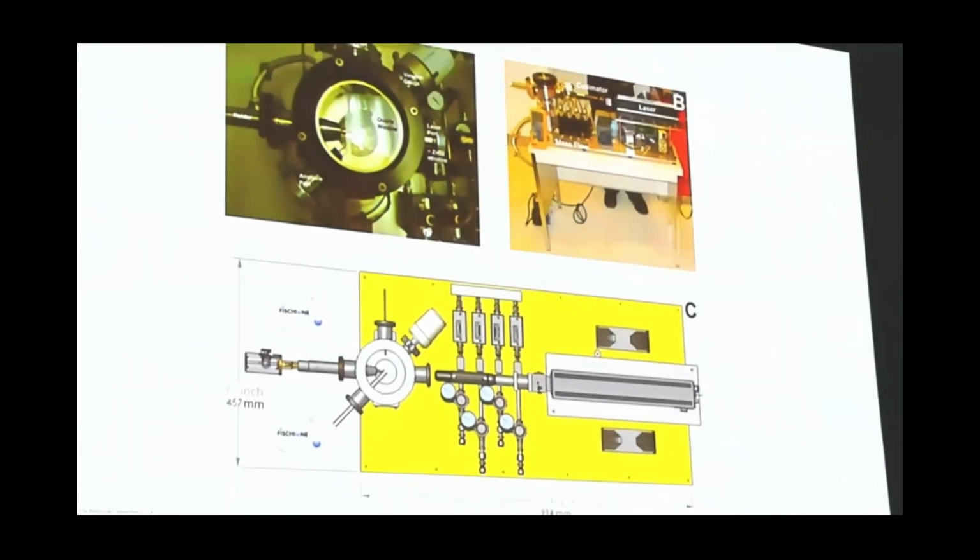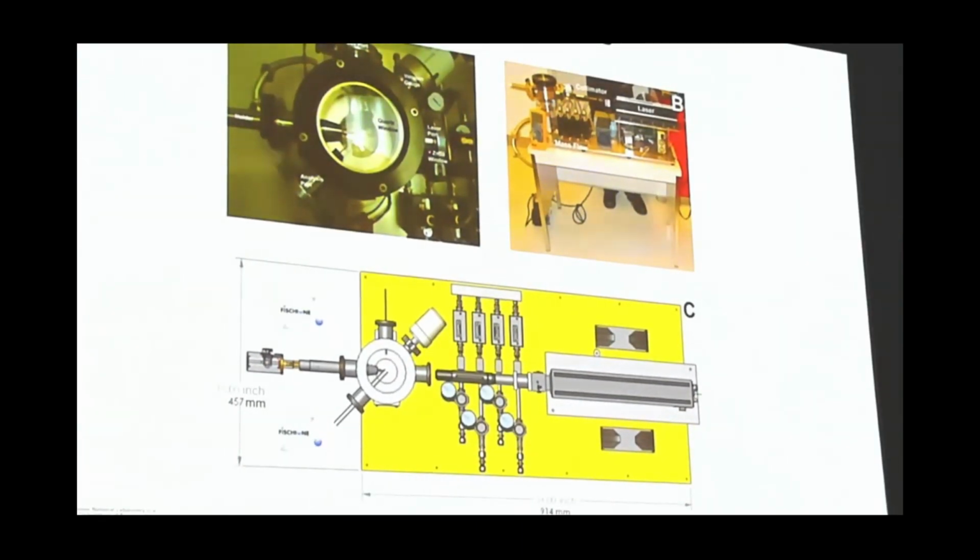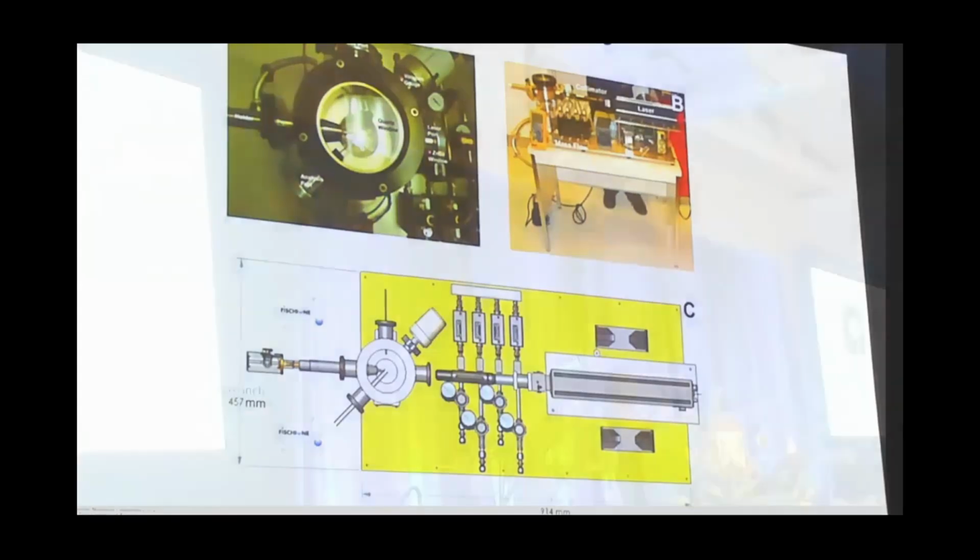With the in situ stages, you are limited by the 2 windows, and as you start tilting, it gets very thick, you can't see, and you can't get up to 70 degrees with in situ holders usually.